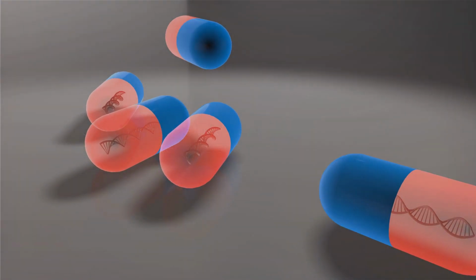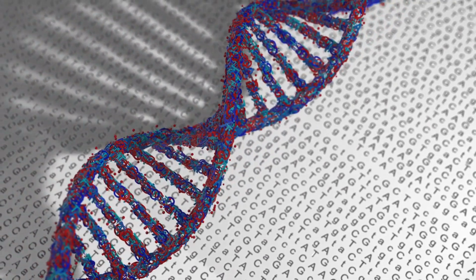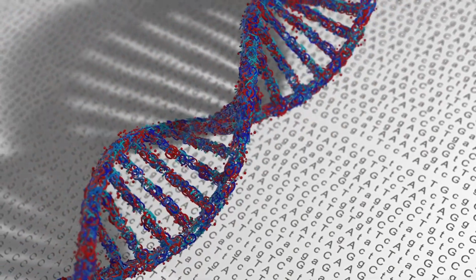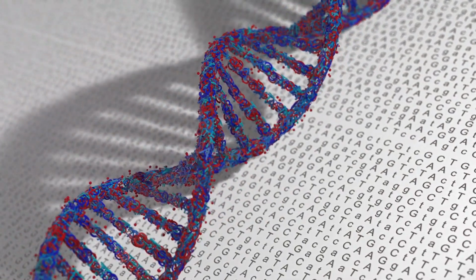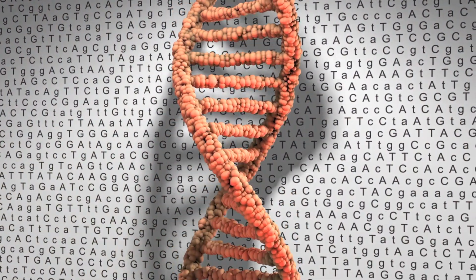Third on our list is biolistic transfection, also known as the gene gun method. This technique uses high velocity to shoot DNA-coated particles into cells. Biolistic transfection can be used for a wide range of cell types, including plant cells, and it doesn't require cells to be dividing. On the flip side, it can cause significant damage to the cells and is not efficient for large numbers of cells.